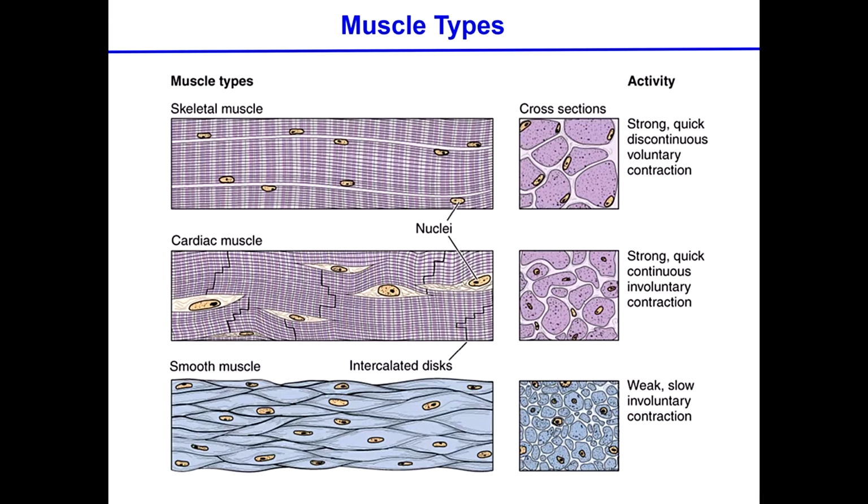Of course, this is not actual sections of anything, but you remember this slide. And then somebody shows you pictures of one type or the other of the different types of muscle, I guarantee you that you're going to have the probability of distinguishing which one is which, all right? Which one is the one that everything is looking straight, which one is the one with the funny looking arrangements in there, and which one is the one that doesn't have anything, it's not striated, okay? So I included this again as a scheme to remember.